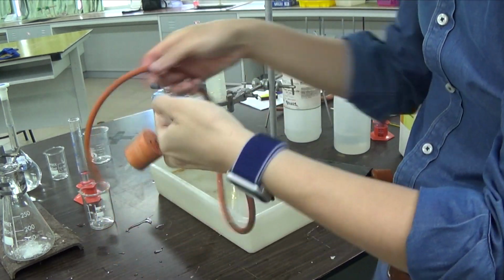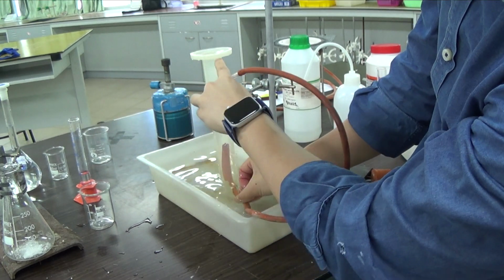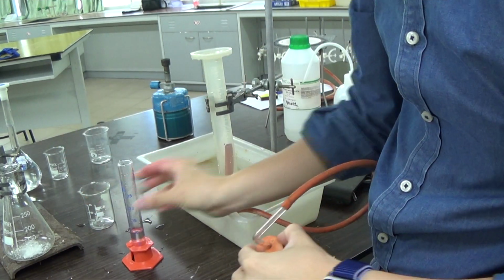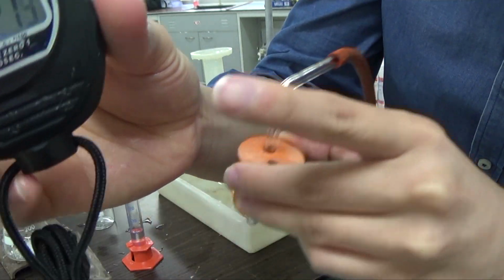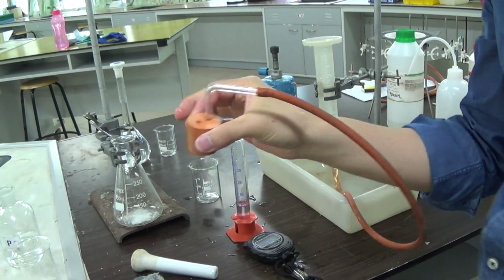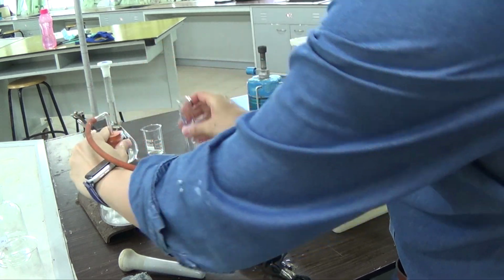I will get this set up first. So this is the delivery tube. So I'll pocket underneath here. So this one reads 0 cm cube at the very beginning. This is now 0.00. I'm just going to start timing first. And then when you reach 10 seconds, what I'll do is I will hold one hand, hold the rubber bung, and then this one.